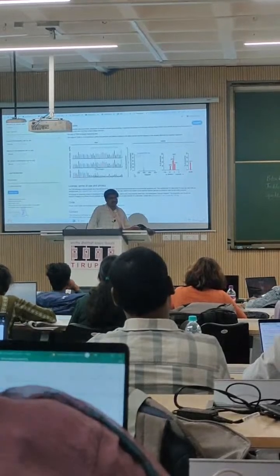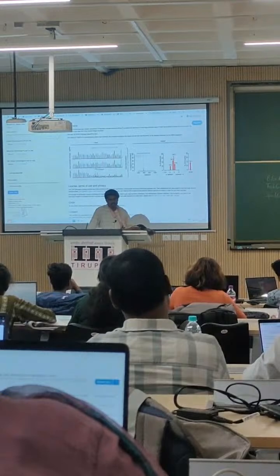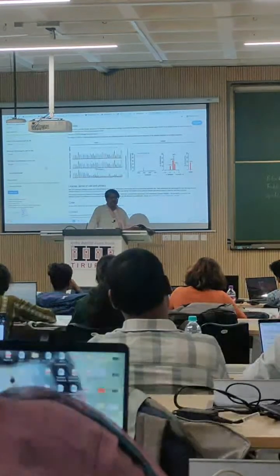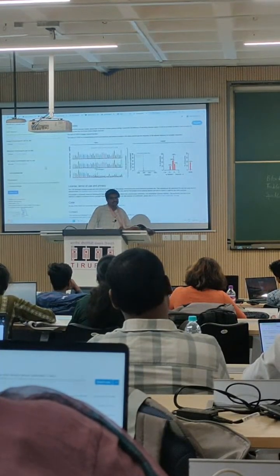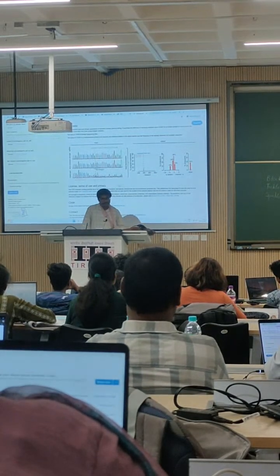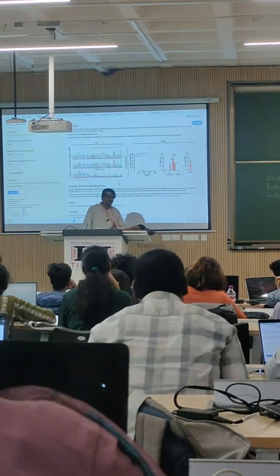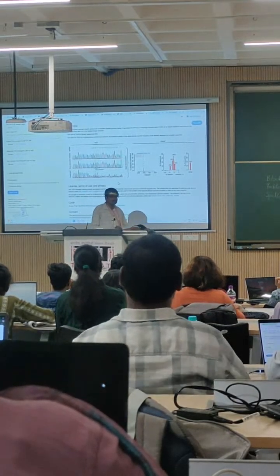First, initially we get the results in the form of chromatograms. The respective chromatograms we need to paste here, and then finally we need to calculate the percentage of single mutation. Okay, this is the final sequencing result. After that, we need to go for the respective trait analysis.